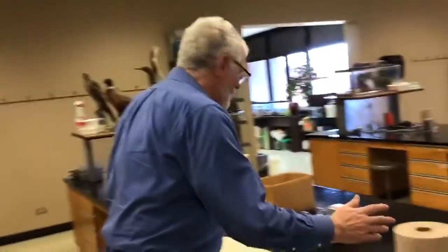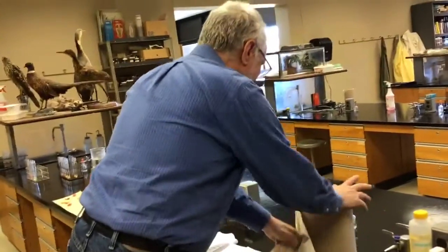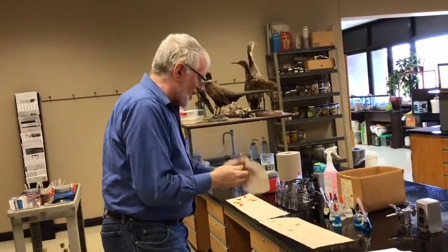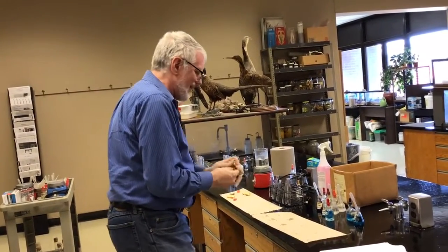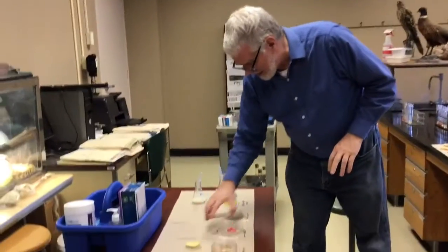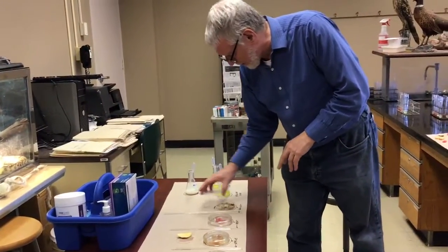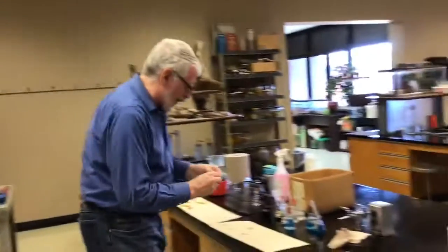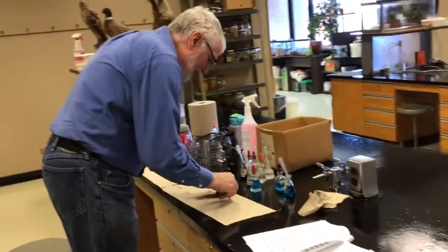I now need to clean my hands. The other things didn't really leave residue on my hands, and I was touching the top of the pieces anyway. Because that's a problem with these, contamination is a really big deal when you're going from one food to another. Here's a piece of walnut. I'm going to crack the piece of walnut and rub it on the paper.